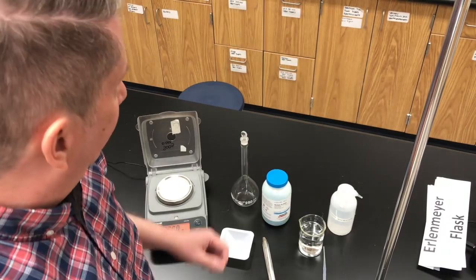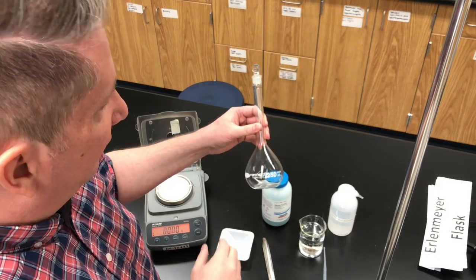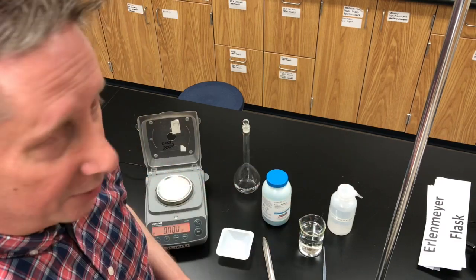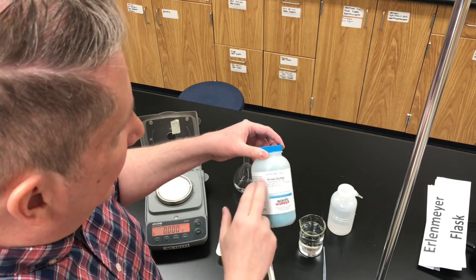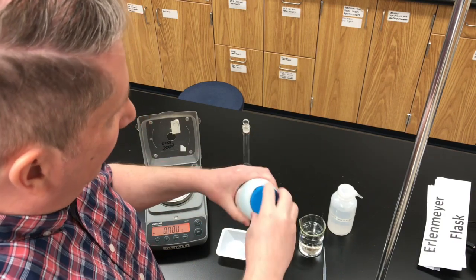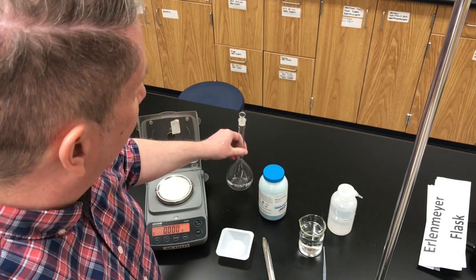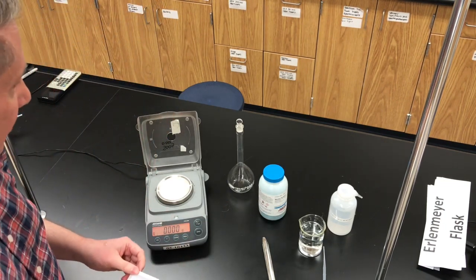All right, so let's go ahead and prepare the solution of nickel sulfate. We're going to make a 250 milliliter solution of 0.200 molarity nickel sulfate. I've got my 250 milliliter volumetric flask ready, some distilled water which will be the solvent, and our solute is nickel sulfate hexahydrate — a green colored salt. We've calculated that we need 13.1 grams of the solute, so we have an electronic balance and let's weigh out the solute.